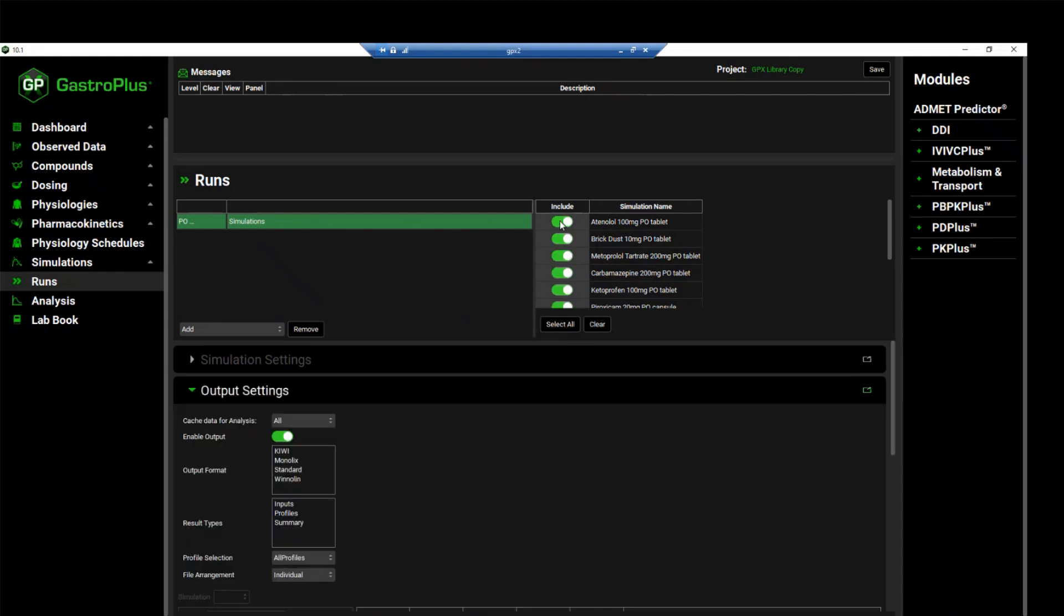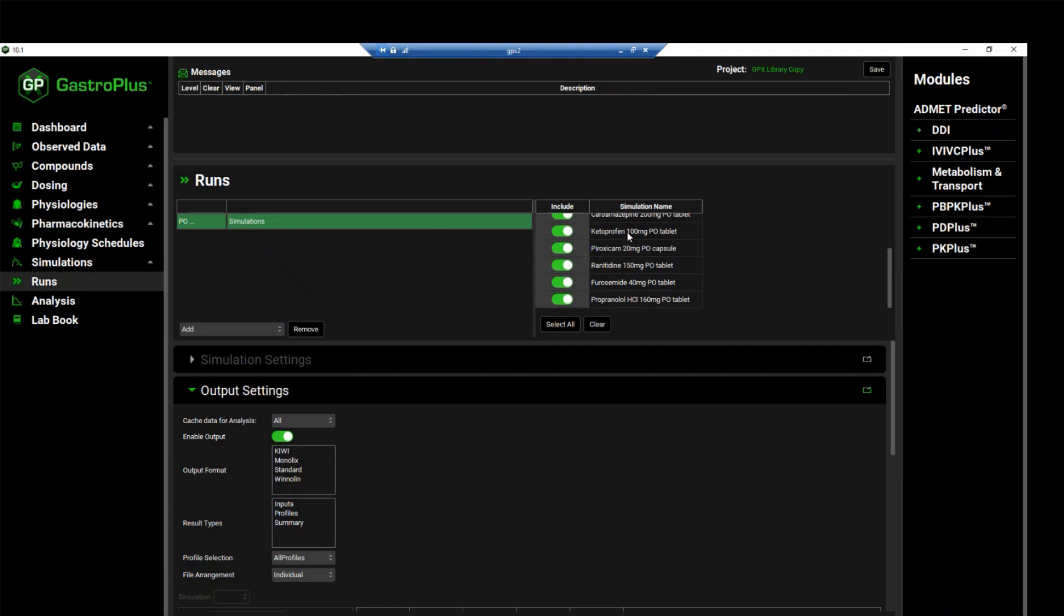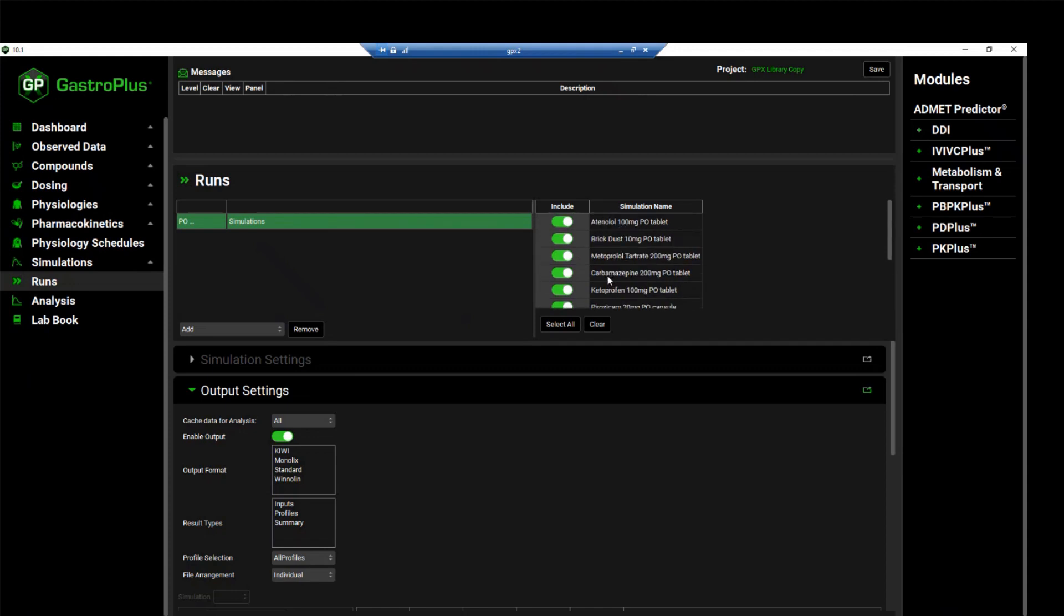As you can see, the toggles under the include column have turned green, indicating that all the simulations have been added to this run. If you'd like to unselect or not include any of these simulations in the run, simply click on the toggle and it turns gray.